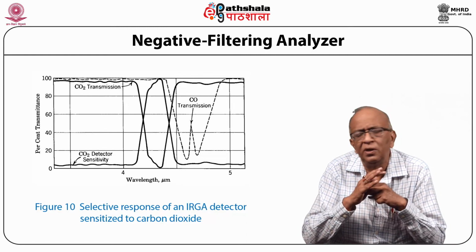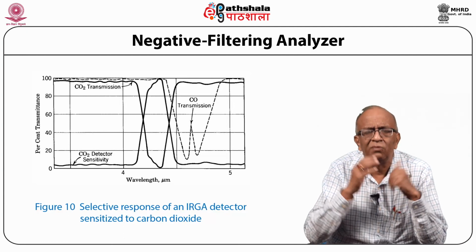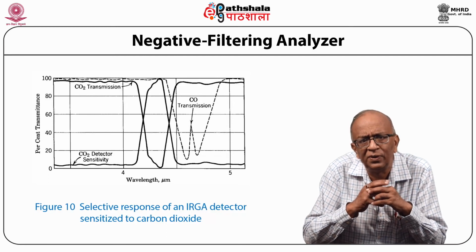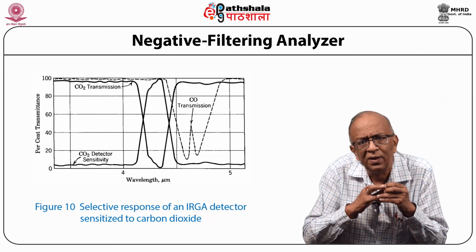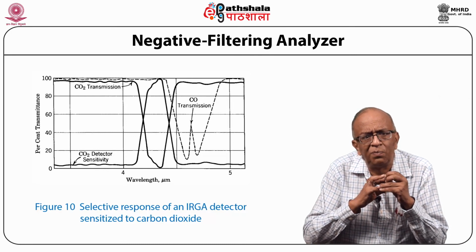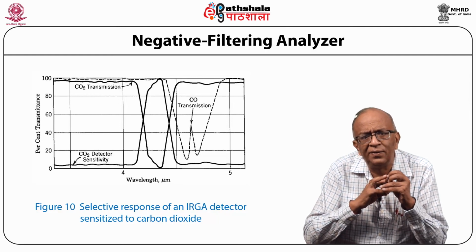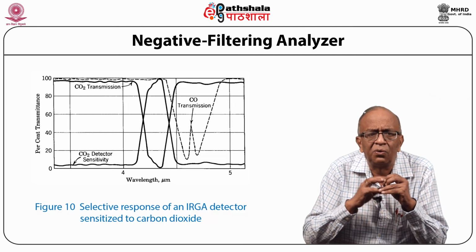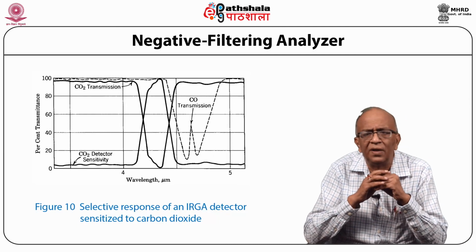It is very important. In the atmosphere, when we want to determine carbon monoxide, this type of infrared gas analyzer is used. Continuous analysis of these components is required for the control of ammonia synthetic plants, boilers, blast furnaces, and metal treatment plants. Other important applications of infrared analyzers are in air pollution studies and vehicle exhaust emission control, as I have told you, in the determination of carbon monoxide and carbon dioxide gases.